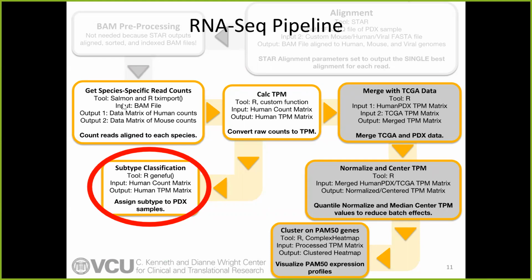So in order to do that, we took the gene expression read counts, and we didn't do a differential expression analysis at this point, although that is in the paper, if you're interested when it gets published. We calculated the transcripts per million because we're looking at absolute expression values here.